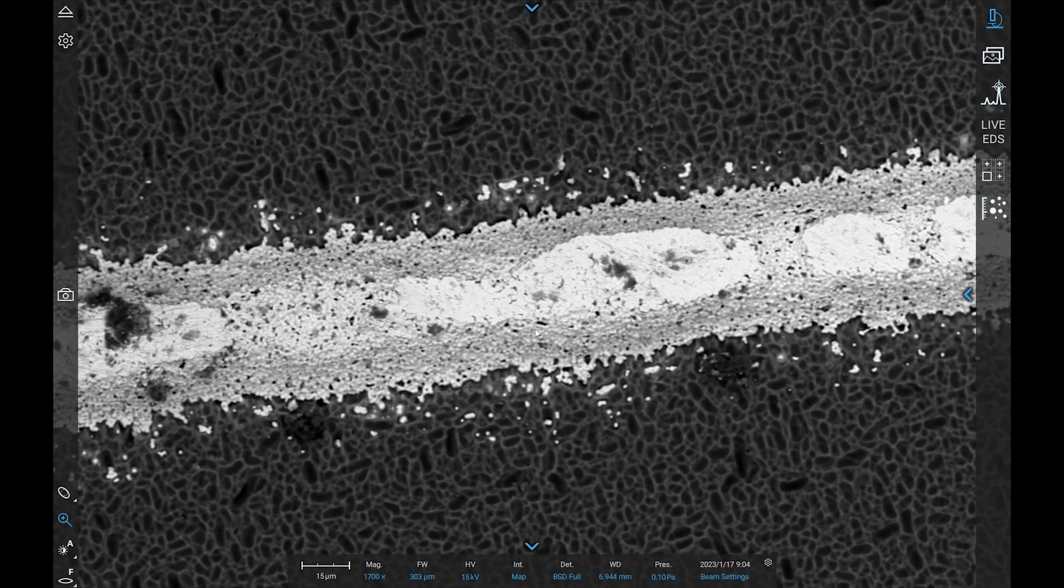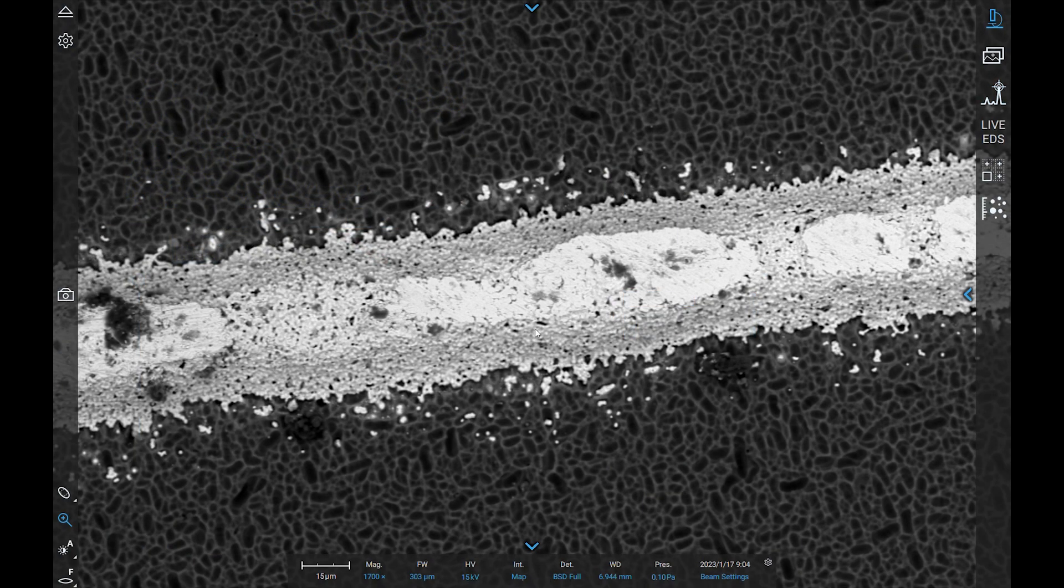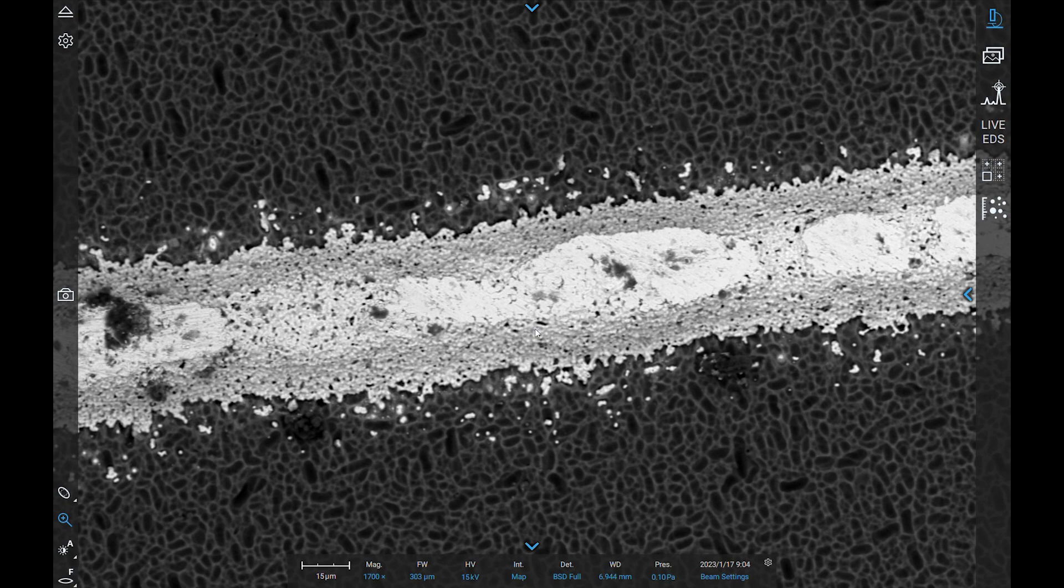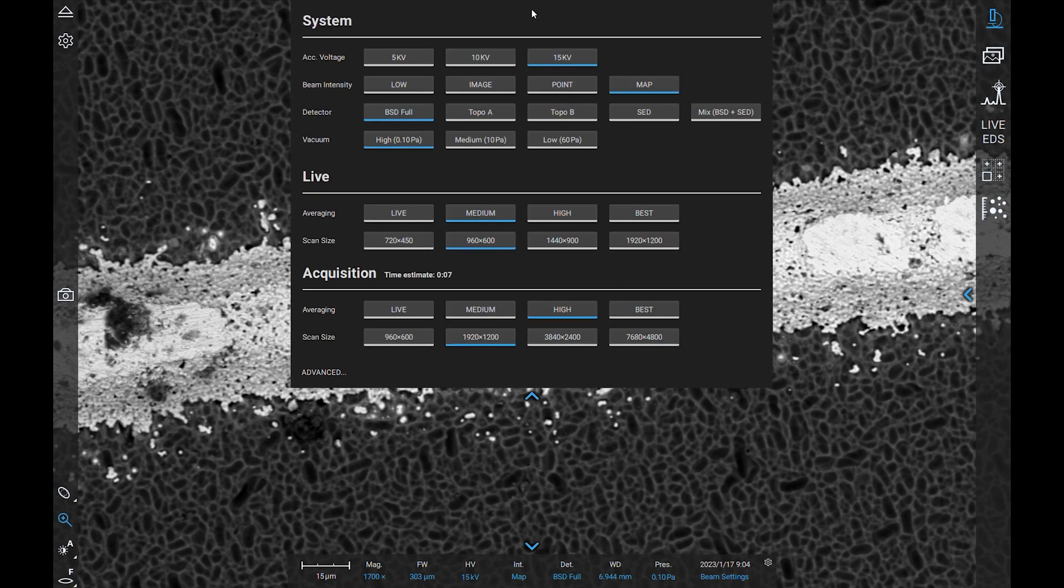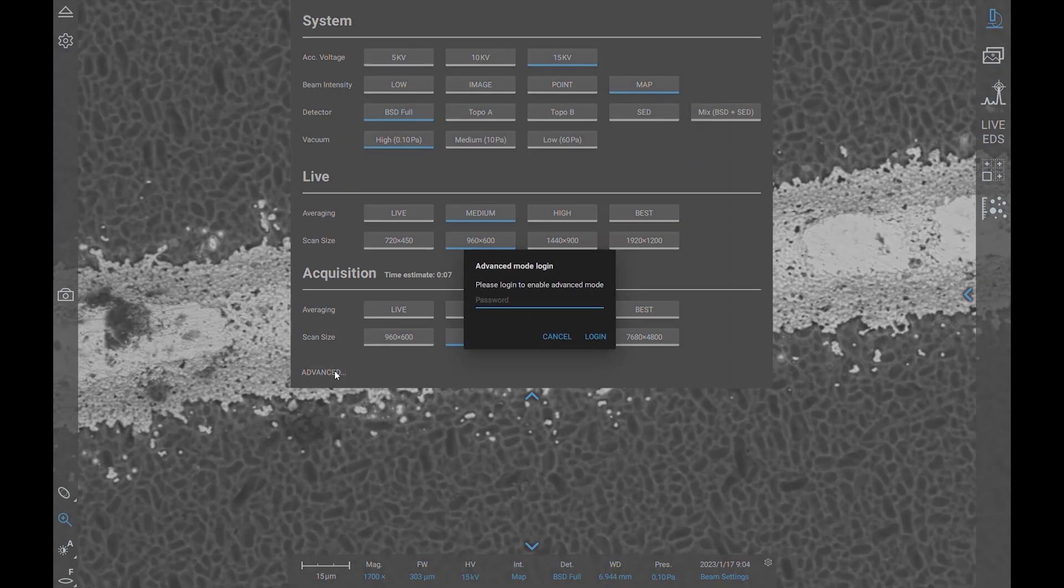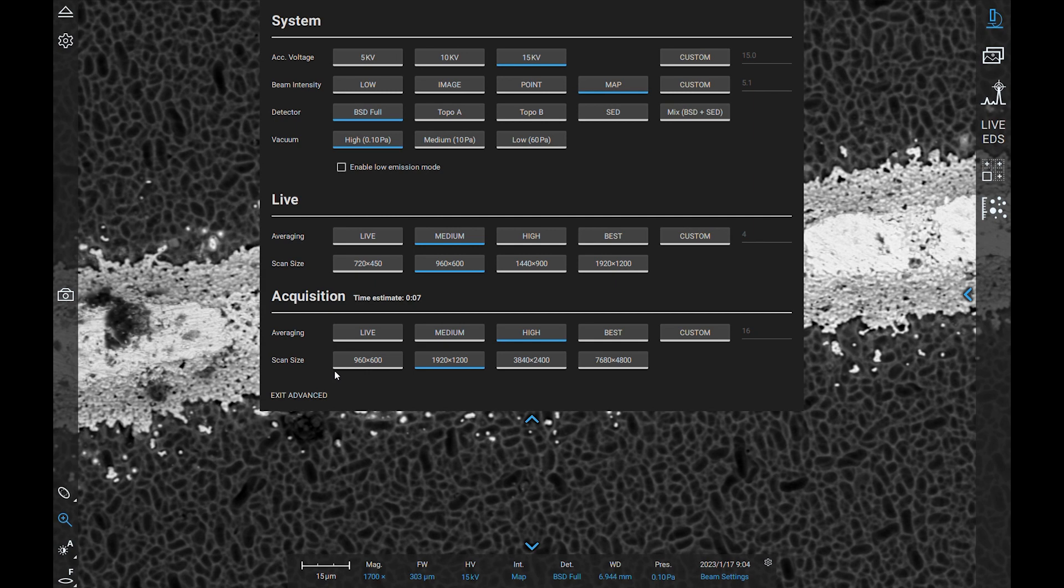For our experienced users, there are a couple of extra settings accessible to you in advanced mode. To access the beam settings menu, left click the blue arrow at the top of the screen. This will drag down the beam settings menu. At the bottom of this menu, there is a button that will allow you to enter the password for advanced mode. When in advanced mode, you can choose your specific accelerating voltage value from 4.8 to 20.5 kV and your specific beam intensity from 1.9 to 5.8.